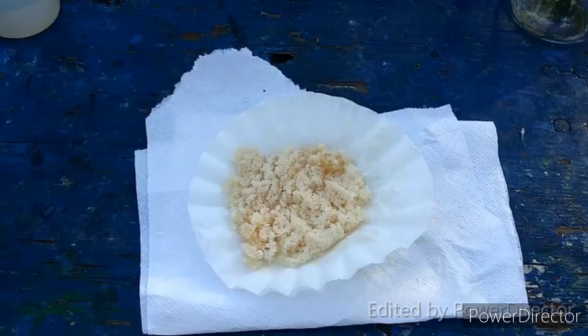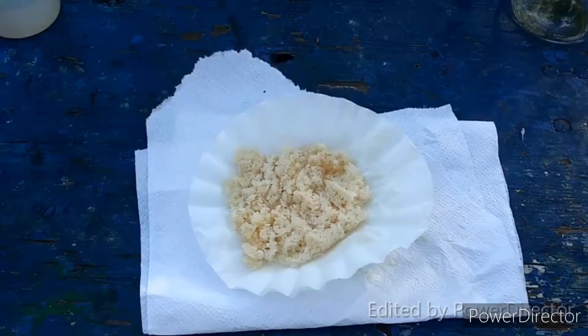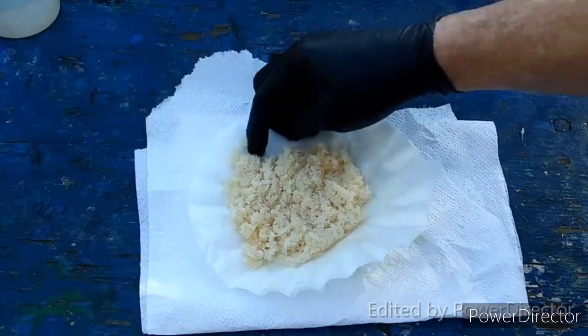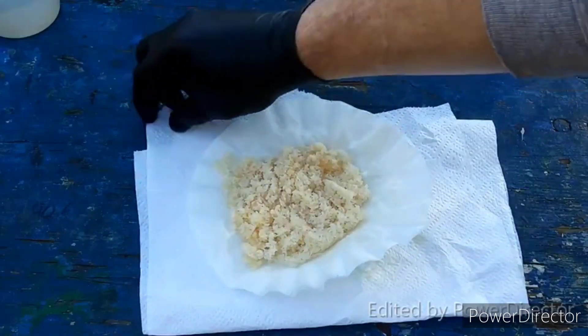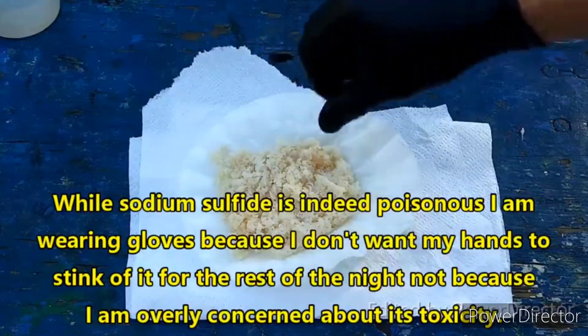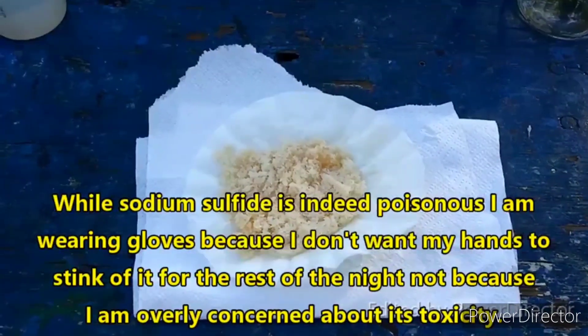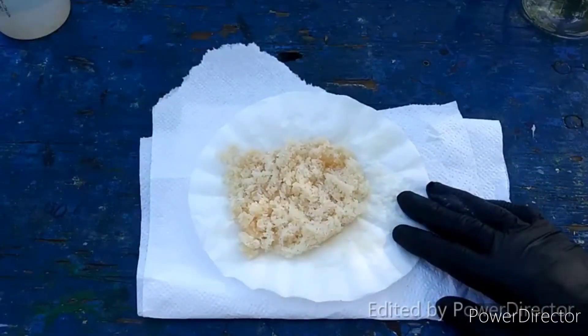That worked out really, really well. This product looks beautiful. I'll take it — it's slightly off-white, but that's fine. It's the first time ever doing it. And look at that, it made a lot of it too. That is freaking great.